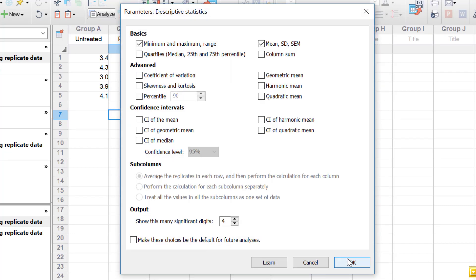In the parameters window, this is where you generally select the descriptive statistics you want to return. Already checked is the minimum and maximum as well as the range — so the minimum value of each group, the maximum value of each group, as well as the range between the minimum and maximum values.